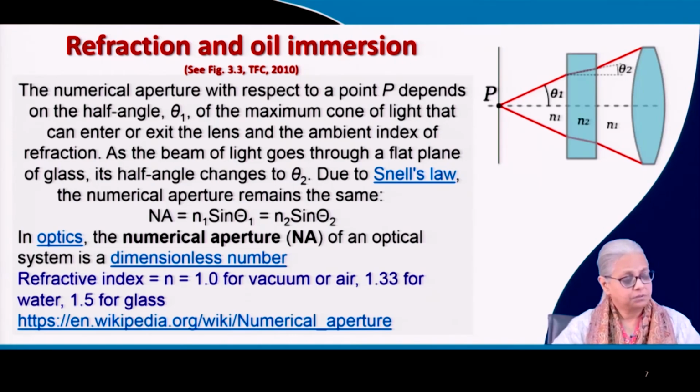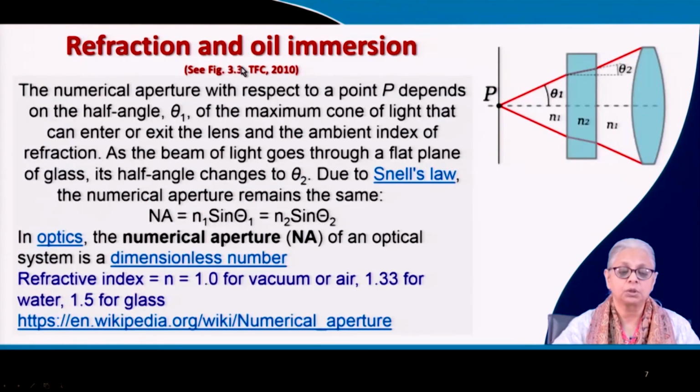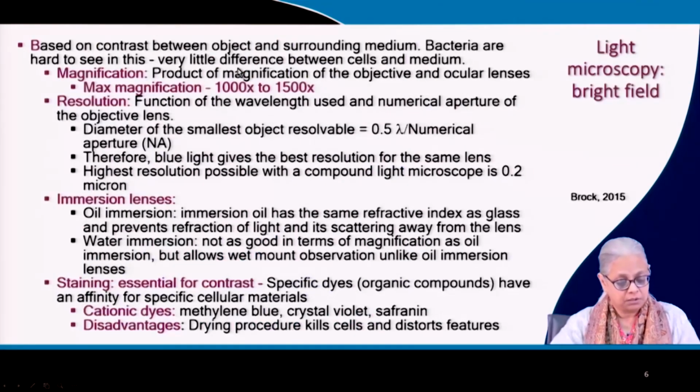That's about it about refraction and oil immersion, and there's a lot more in the textbook. There are some very good graphics in the textbooks, so please refer to them for more details, and that will help you to understand what I'm talking about. Like I said, oil immersion gives you the best possible results as compared to air and water.